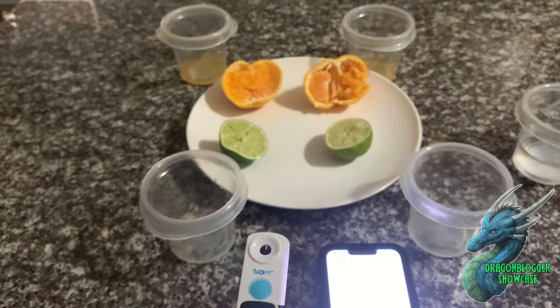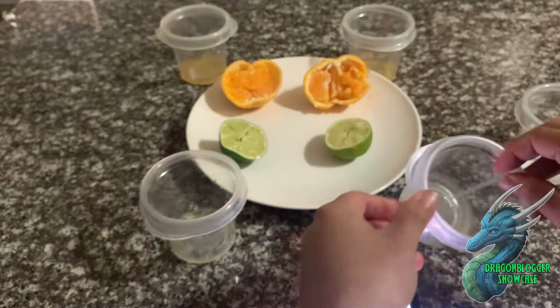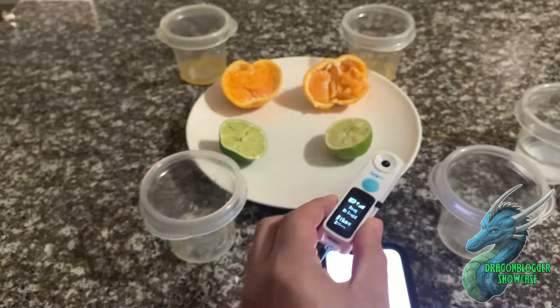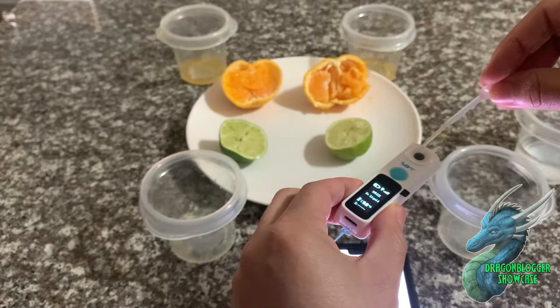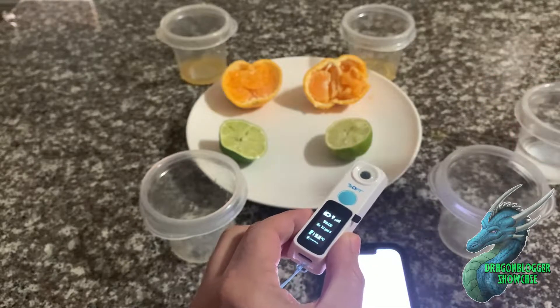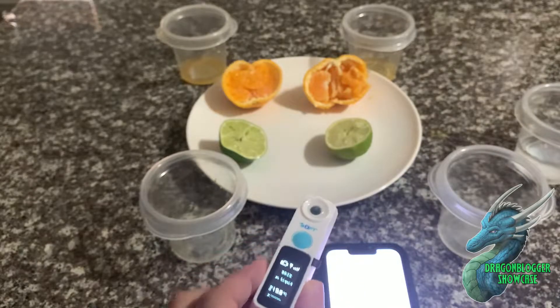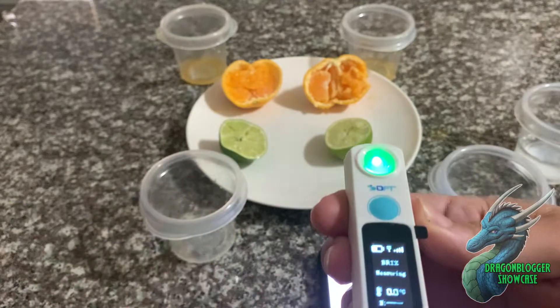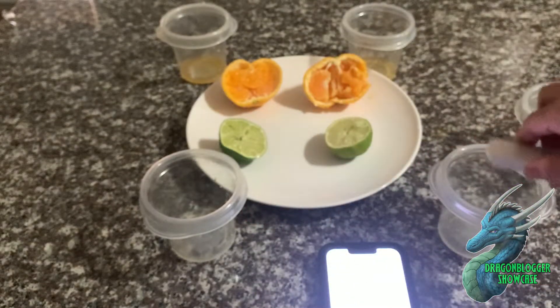First I'm going to test the less ripe lime — it was the lighter one. I'm going to get some lime juice in here, go ahead and put it on the top, and make sure that the sensor is completely covered. For this first test I'm going to squeeze out the excess lime juice and then clean it out in the water so it's ready for the next use. I'm going to do a short press on here and it's going to turn green while it's testing.